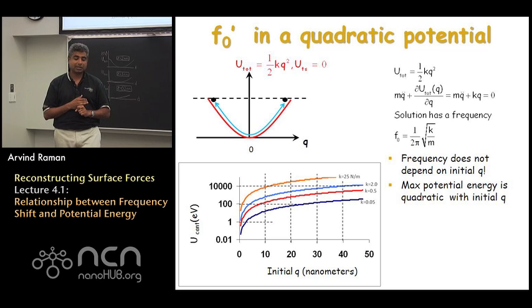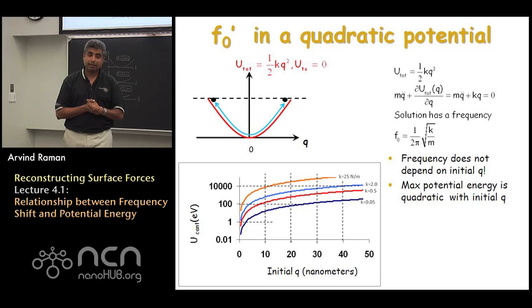The second conclusion that comes out of it is that when you have a purely quadratic interaction potential well, or purely quadratic potential energy landscape, the frequency is independent of the oscillation amplitude. So that comes out of the solution of the problem. But basically, when you have this quadratic well, it doesn't matter how high you start it, the frequency and the time period are going to remain exactly the same. So this is what's called an isochronous kind of oscillator.